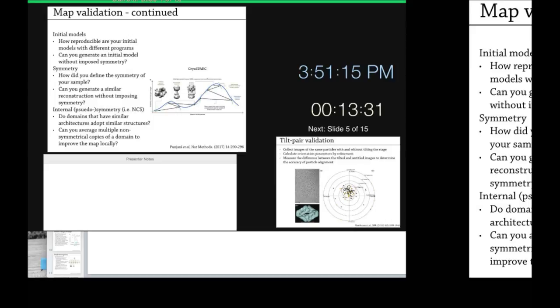And you can either tell it that you have one initial model, or maybe if you know that within your data you have 3 or 4 different types of conformations, and you want to try to sort those out at the initial model stage, you can tell it that you have 3 or 4 different samples all within this one data set, and you can start to sort those out. And so by doing this, you start with just initial raw particles. By subsampling over and over again, you can start to build up information about what the molecule should look like, and then you can get a pretty viable initial model. This can then be put into RELION, FREALIGN, whatever your reconstruction program of choice is, and then go to higher and higher resolution.